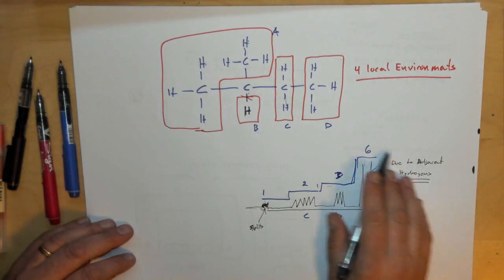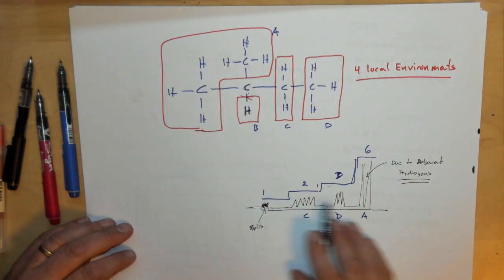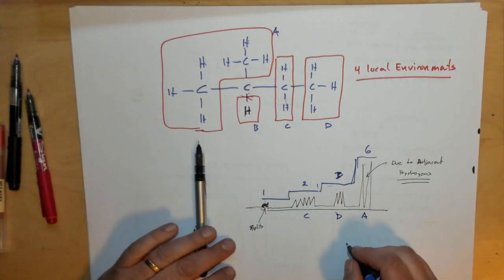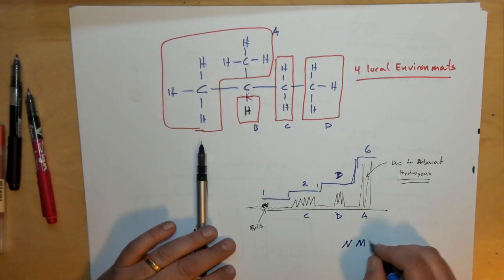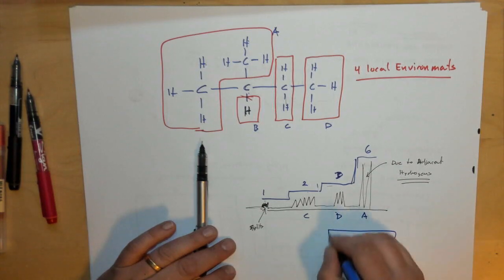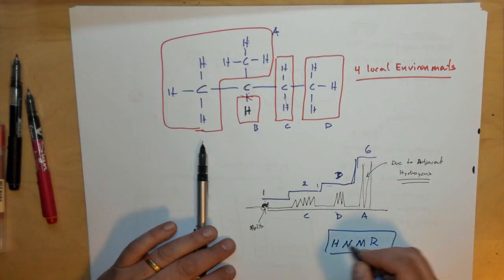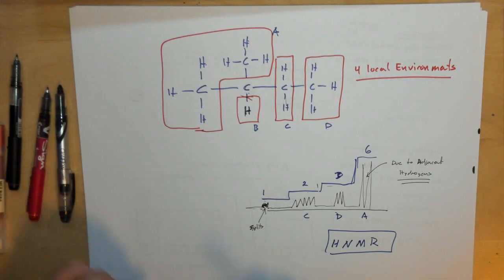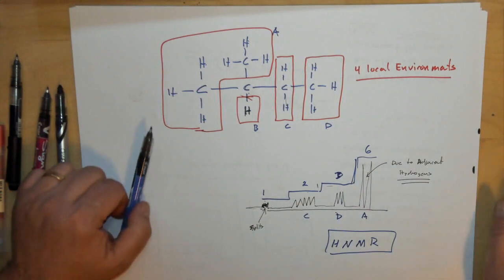So this is one way of looking at molecules with something called NMR. And in this case we've used HNMR, or proton nuclear magnetic resonance. And I'm going to end my movie there.